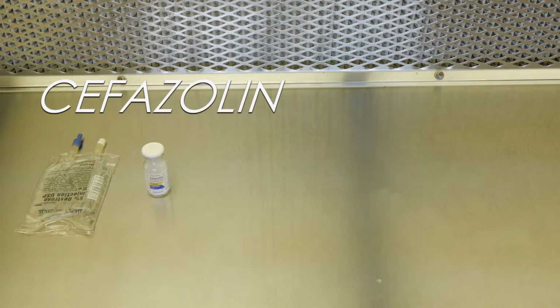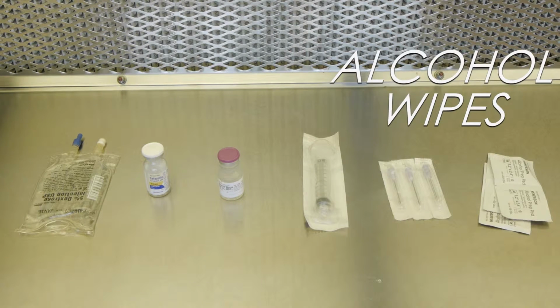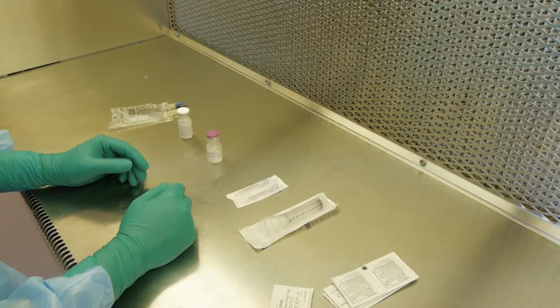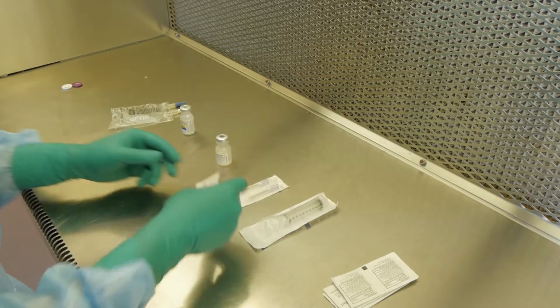Next, you will make an IV antibiotics bag by reconstituting an antibiotics powder. For this, you will need the following. Remove the caps from each vial, then wipe them off with alcohol pads like we did in the previous preparation.